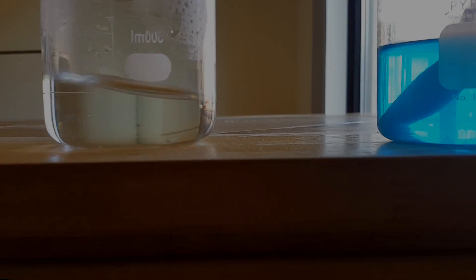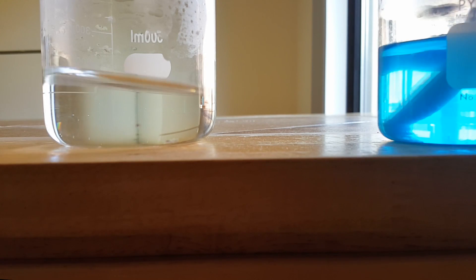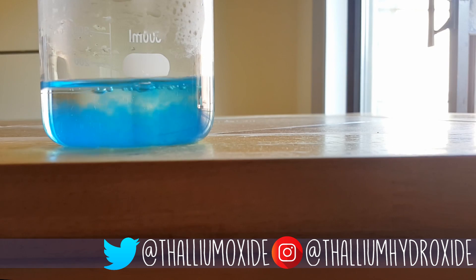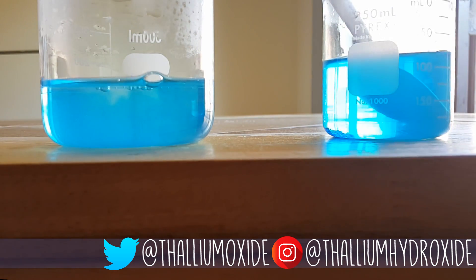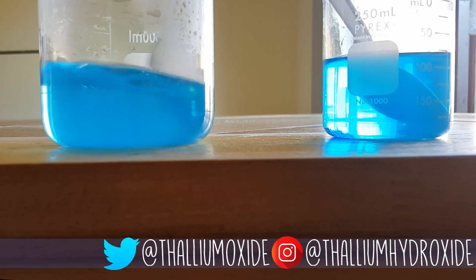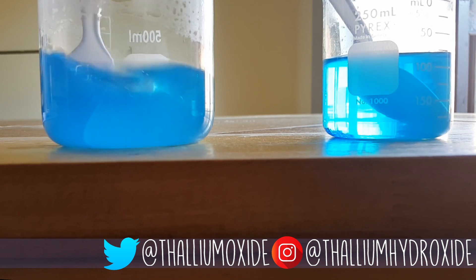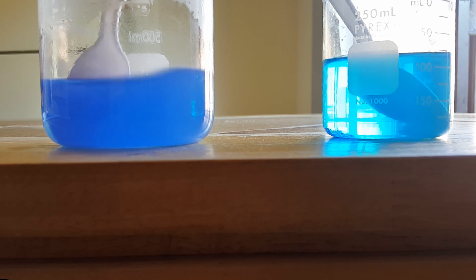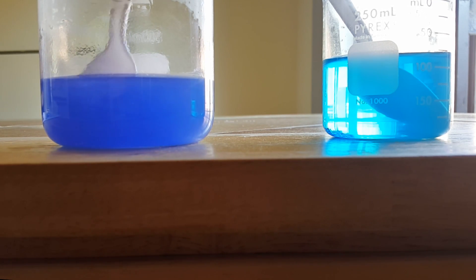Once dissolved, I added a little bit of the copper sulfate solution into the NADCC solution. You can see that as this reaction starts up, a milky precipitate kind of forms and then is dissolved away. And then almost immediately it turns this deep purple color.